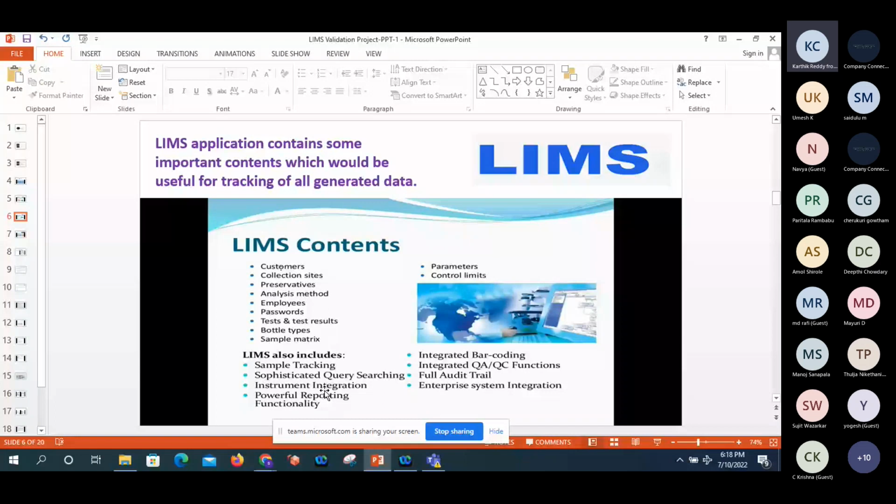After that, in the quality control laboratory there is a huge variety of instruments, like balances, which are port-based instruments, and KF, SOR, IR, and UV, which are file-based instruments. Then there is also CDS integration, which is called the LIMS CDS interface.